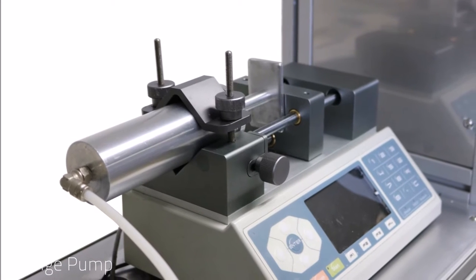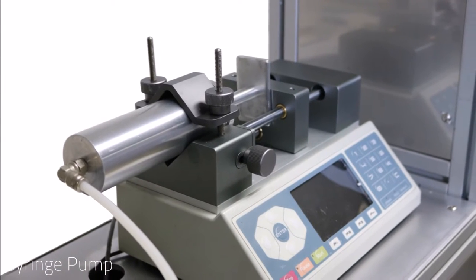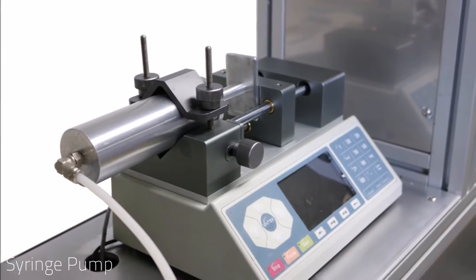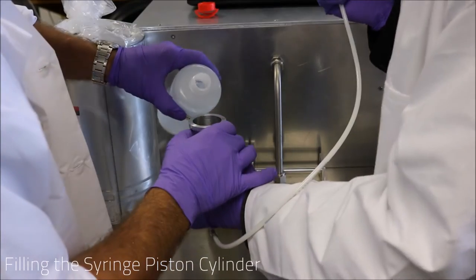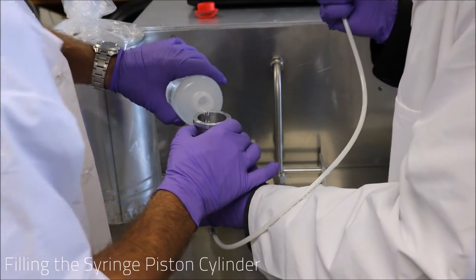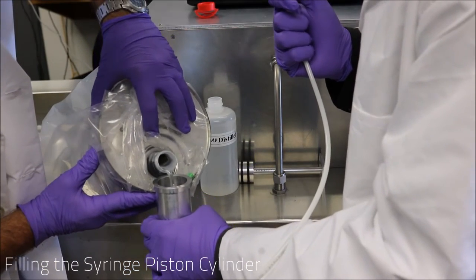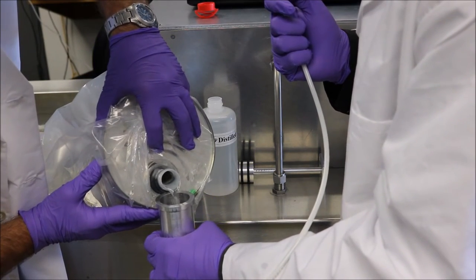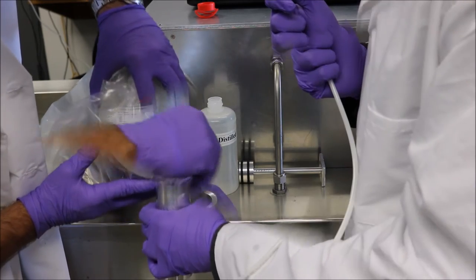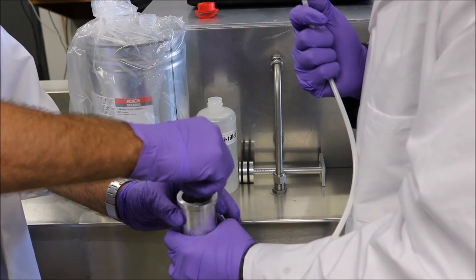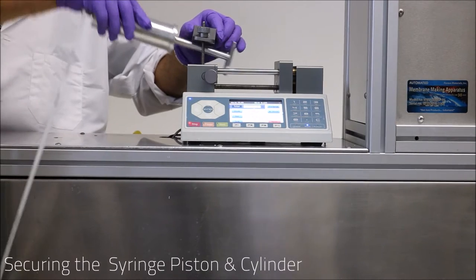The syringe pump is used to hold and pump the bore solution at a predetermined rate. Here we begin by filling the syringe piston cylinder. Fill the cylinder halfway with distilled water and the rest with your solvent. Make sure that the solution is mixed well before the next step. This ratio can change based on the composition of your bore solution.